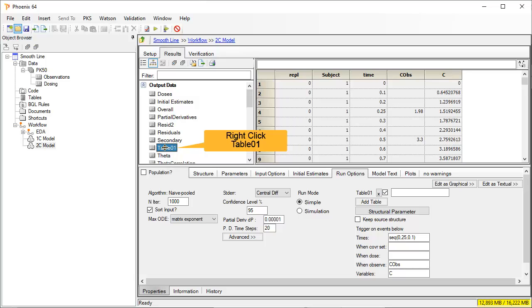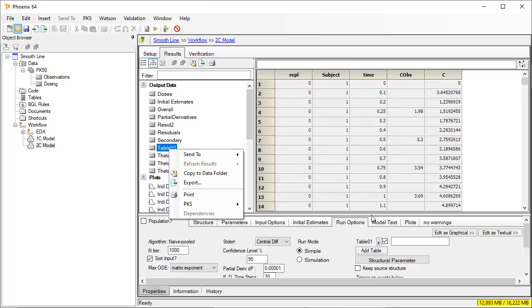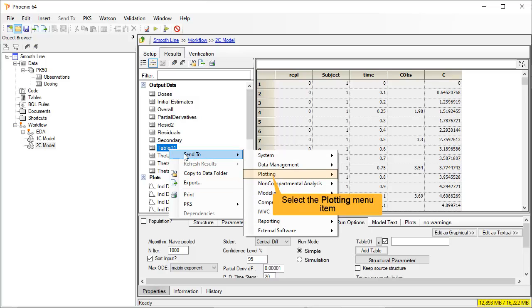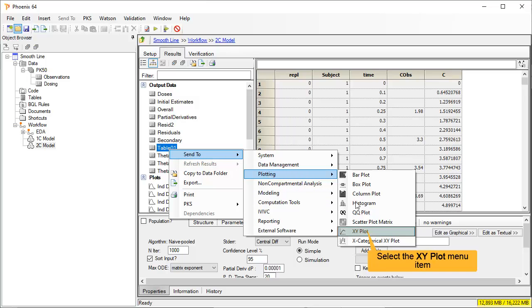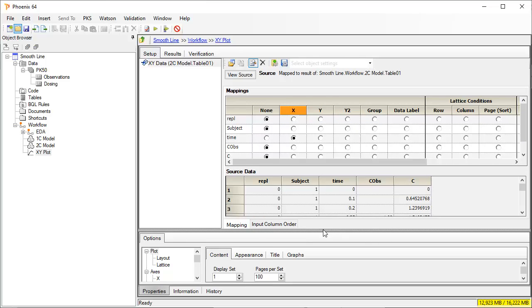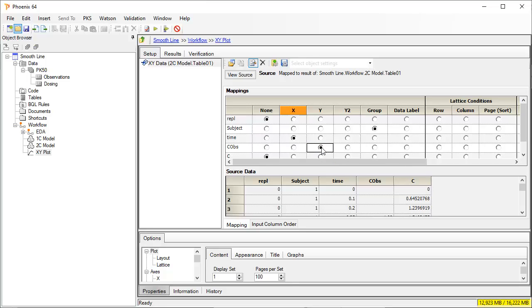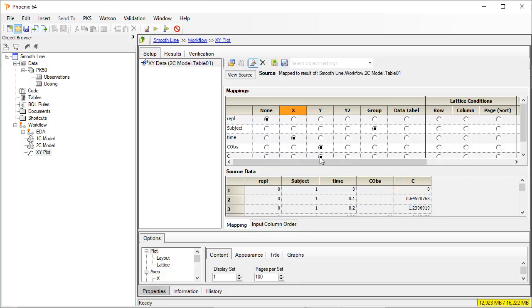We right-click on Table 1 and send the worksheet to an XY plot. We map Subject to Group to overlay all the profiles. Time column has been automatically mapped to X. We select COBS to be plotted in the Y axis. We also map predicted concentration C to Y. We execute the plot.